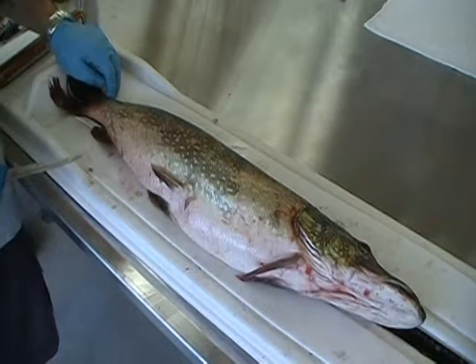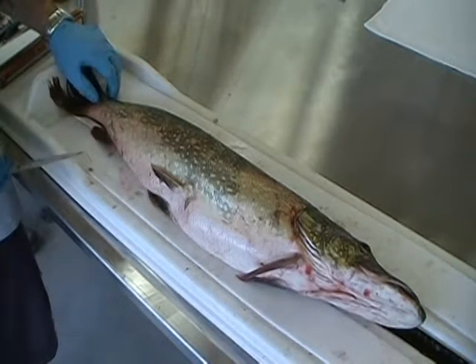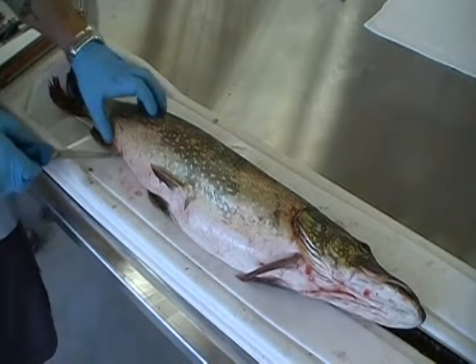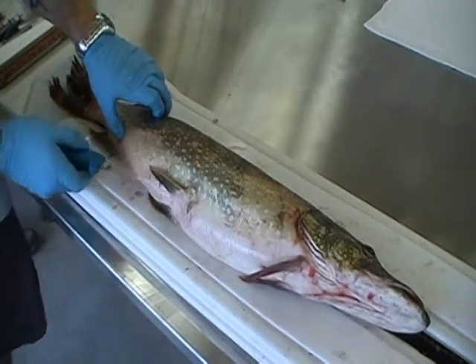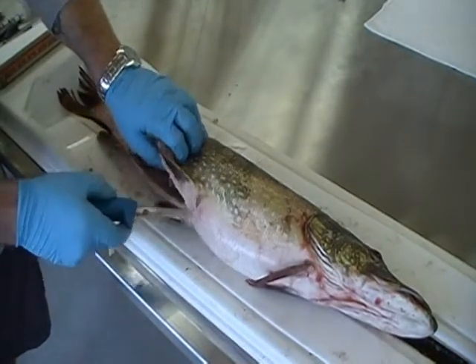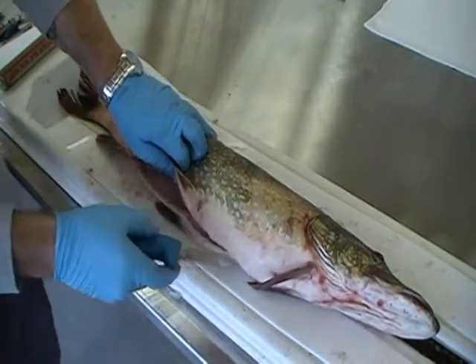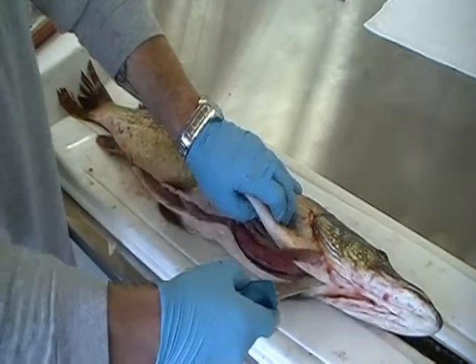At this point, we'll want to identify the gonad and the gonad condition — being the sex and maturity of this northern pike. To make the incision through the pike's tough skin, I suggest going through the vent, keeping your knife pointed upwards. Go right through the ventral girdle of the fish, proceeding towards the pectoral fins and the pectoral girdle.